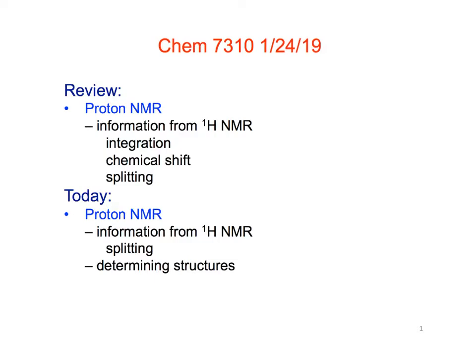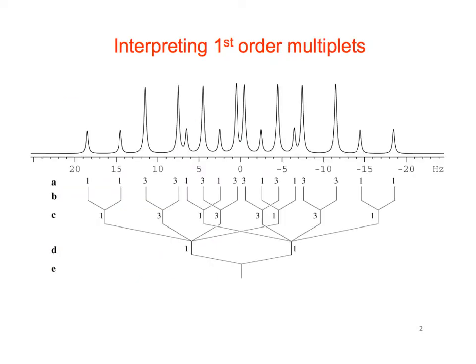All right, so we have just a little bit more to cover on splitting. And then we'll be ready to start working problems and applying what we've learned. So let's look at some more complicated splitting patterns. And these are still all pretty well resolved and have excellent signal to noise. But let's see if we can pick out some patterns.